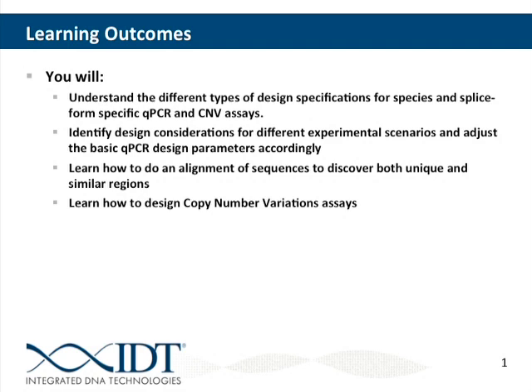So hopefully at the end of this session you'll understand the different types of design specifications for some of these different applications, including species and splice-form specific qPCR and CNV assays, and be able to identify certain design considerations for the different experimental scenarios that you experience, and be able to adjust the basic qPCR design parameters according to these more specific needs.